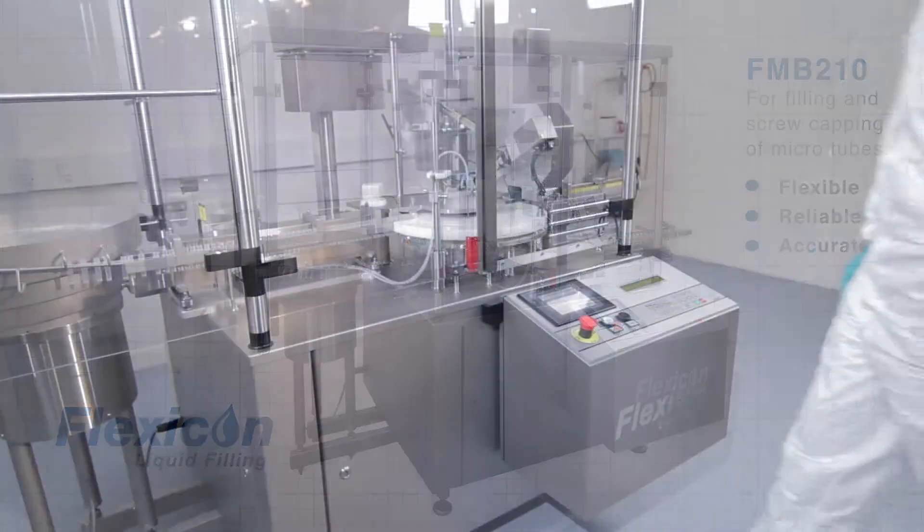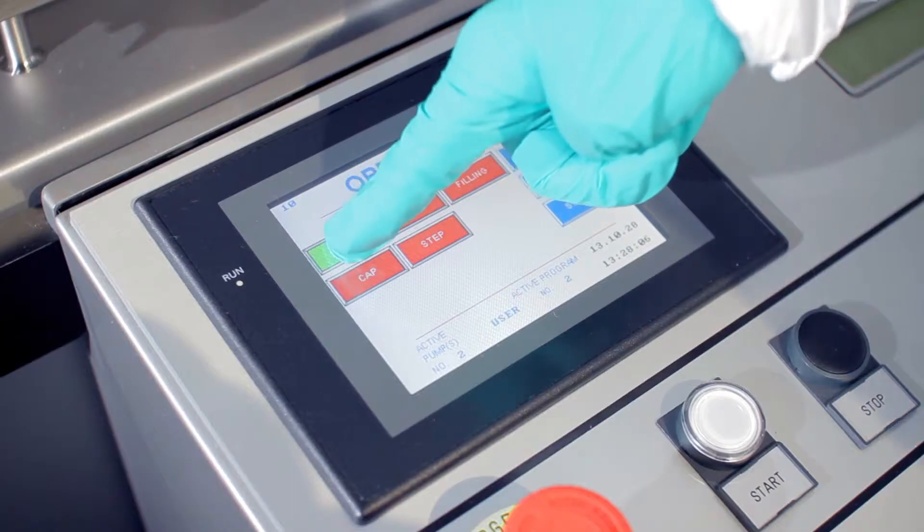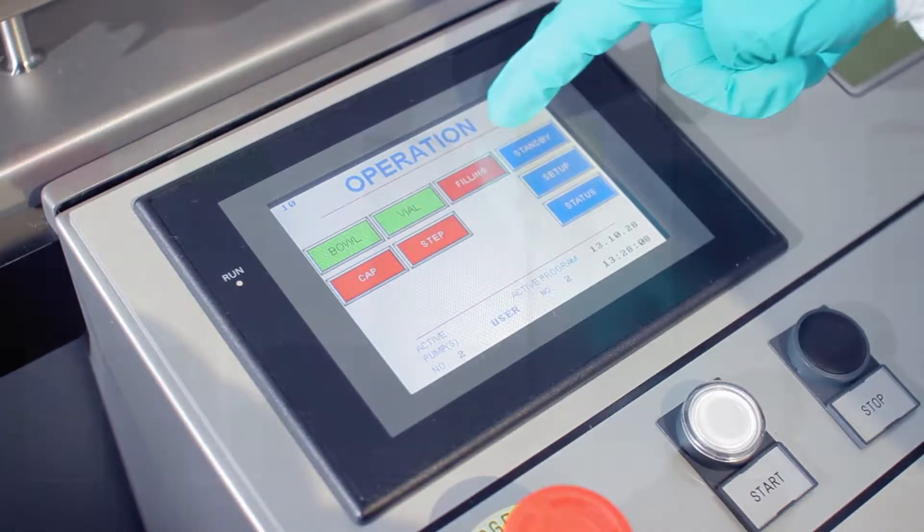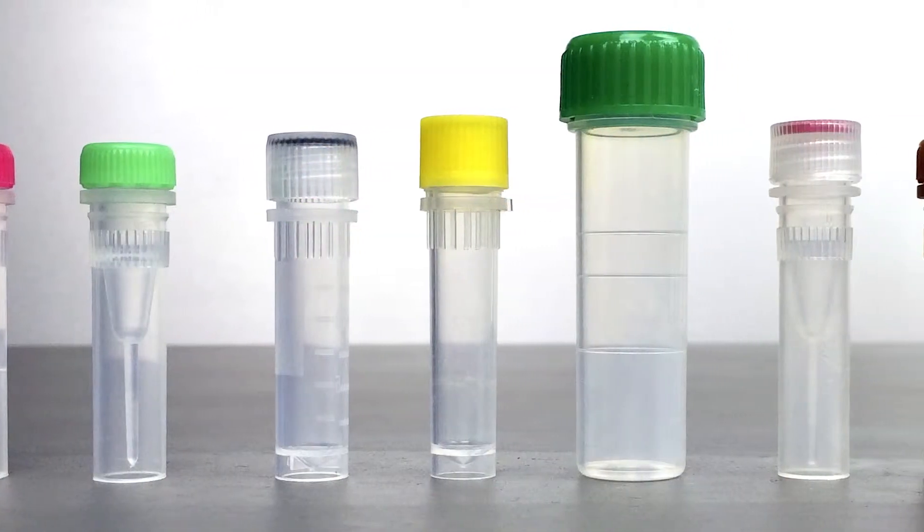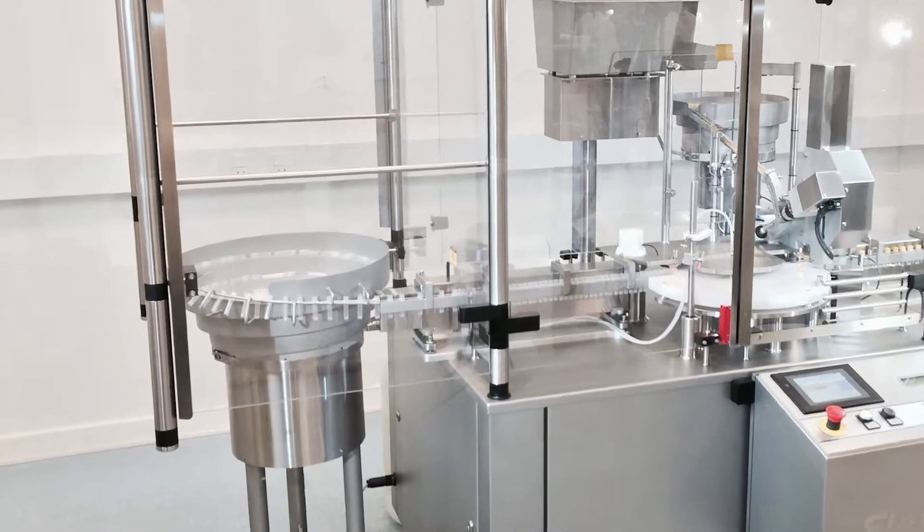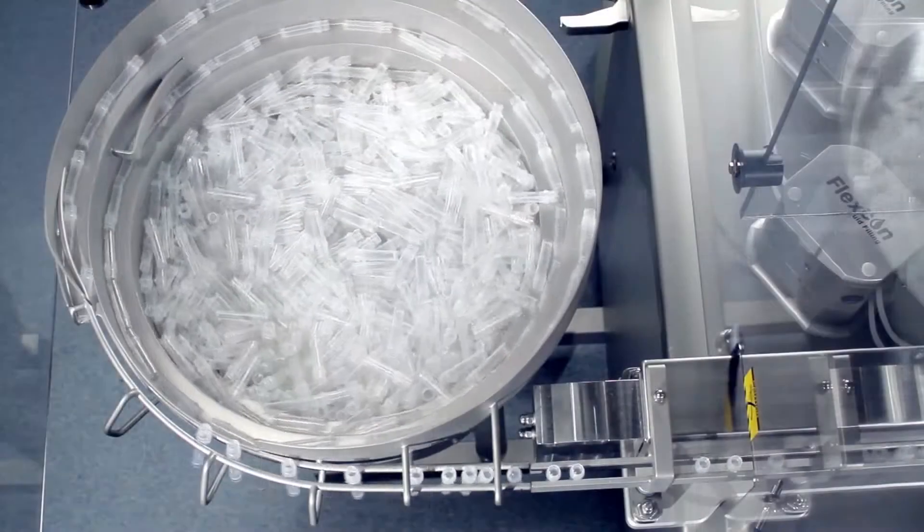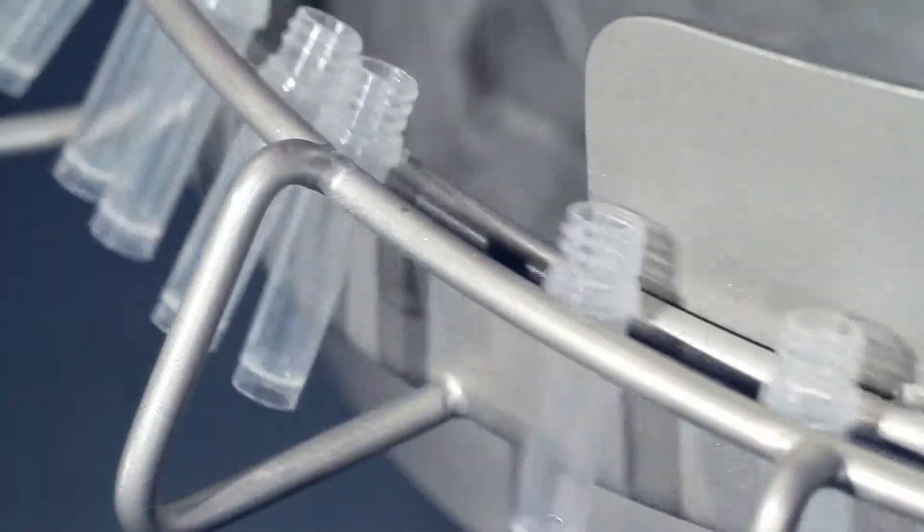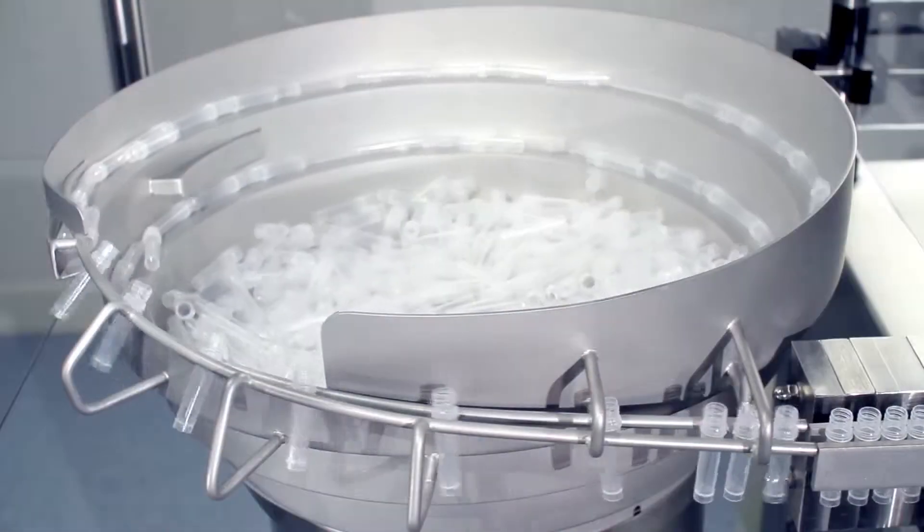Flexicon's FMB210 is a family of fully automatic filling and capping machines capable of working with many different liquids, fill volumes and a range of containers. One version of the FMB210 is ideal for aseptic filling and capping of microtubes in the biotech and diagnostic industries.